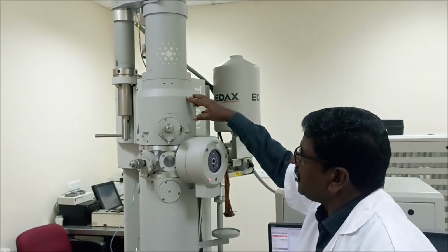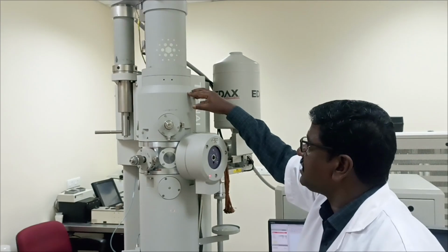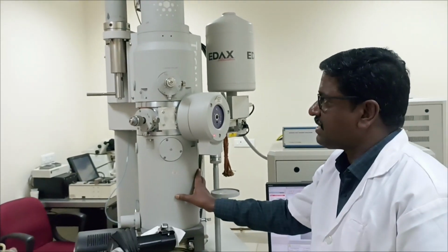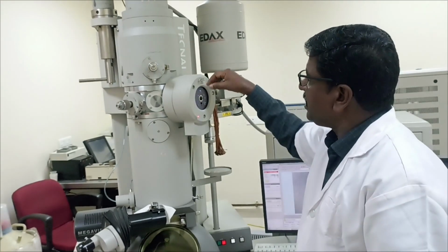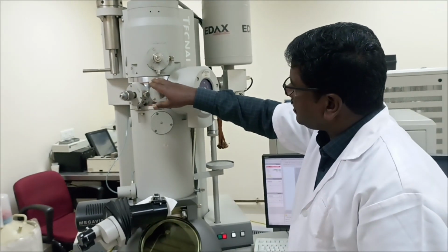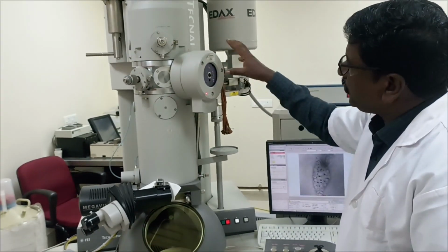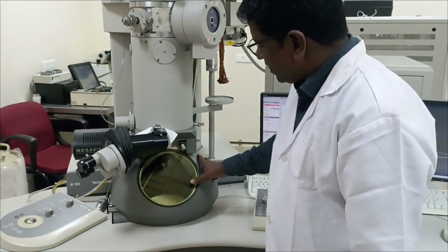In this electron column, we have set up electromagnetic lenses like condenser lenses and objective lenses. After that we have a set of projective lenses, and this is called the goniometer, through which we keep the sample in the sample stage. The sample stage is in between objective lens 1 and 2, through which we keep the sample. And this is called the fluorescence screen.